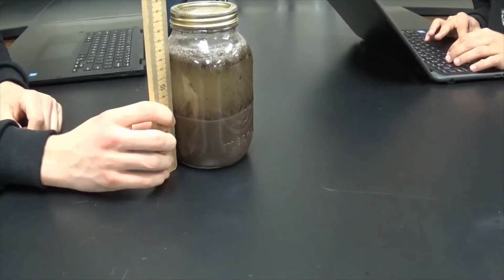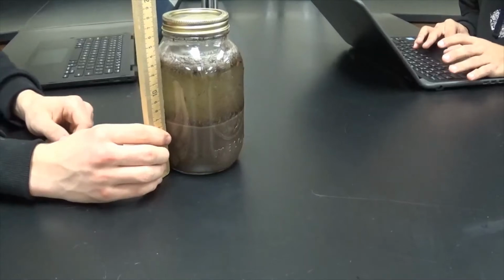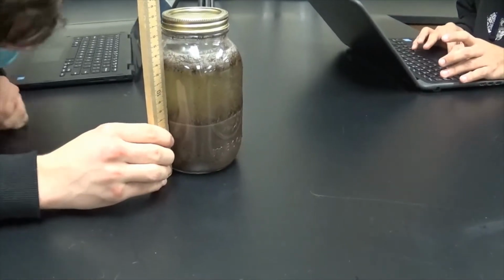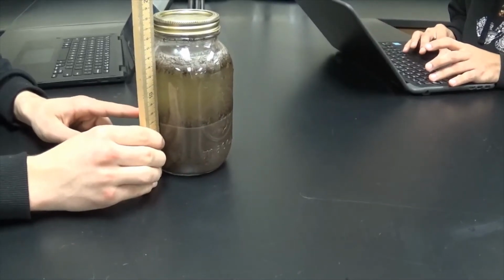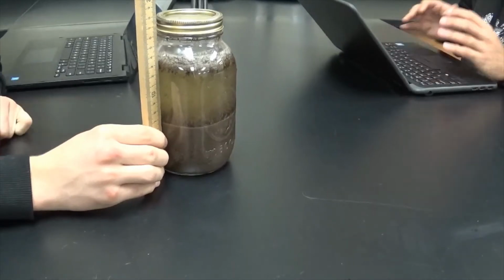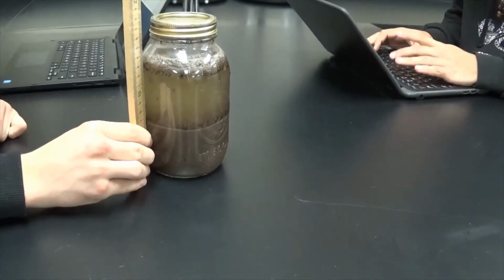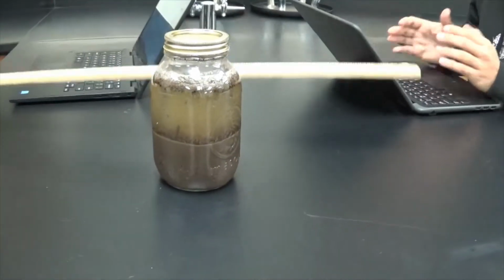Okay, so which one are you measuring first? I was probably going to measure the clay first since it's at the top. Okay. So how much clay do you have? There's not much. It's about from here to here, honestly. I'd say half an inch of clay. Half an inch? Okay. So record that in your lab report.